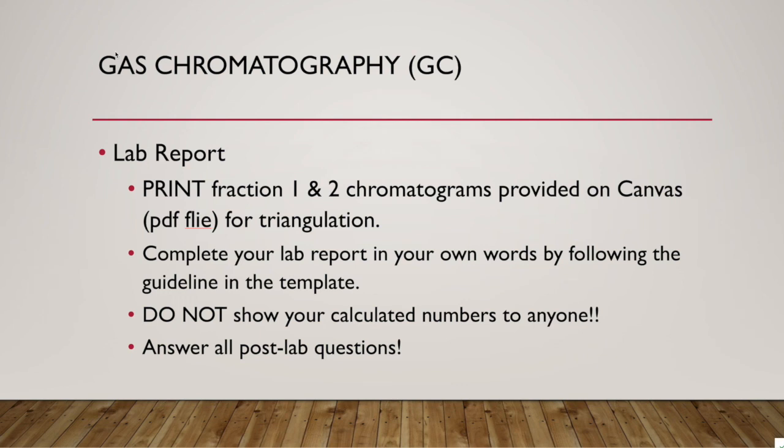So for the lab report, as I mentioned earlier, you have to print the fraction 1 and 2 chromatograms from the Canvas, and then complete your lab report. Don't forget to attach or copy and paste your distillation curve as well, and basically just follow the guideline in the report template.